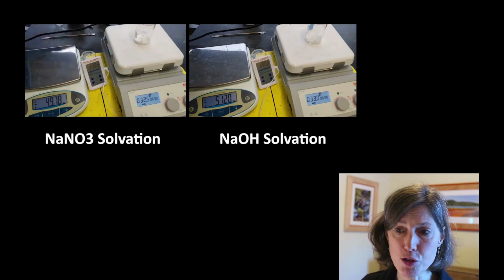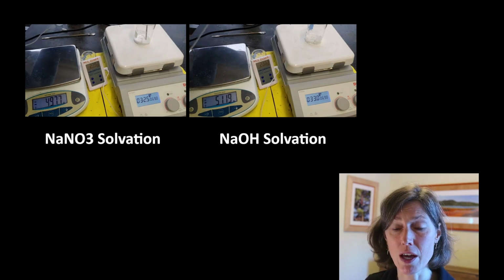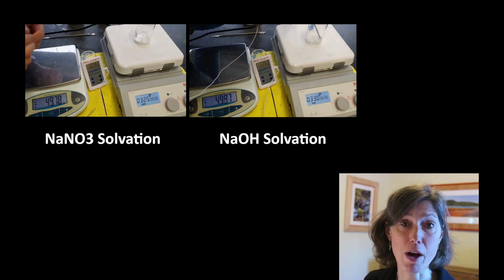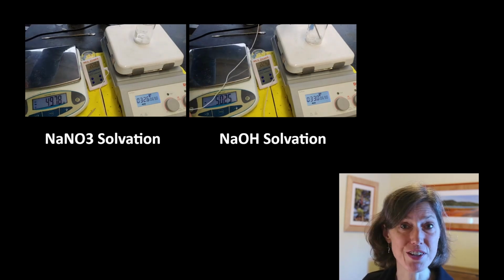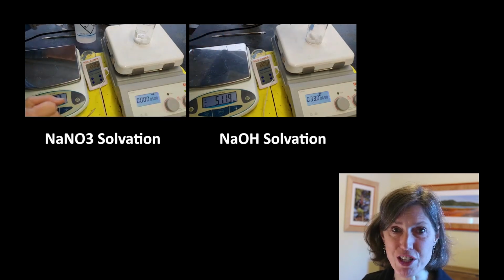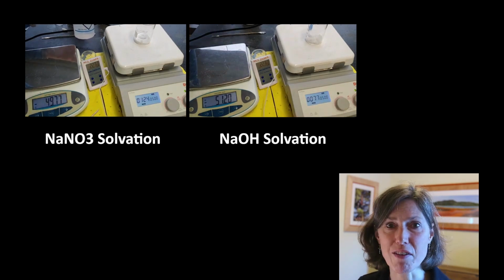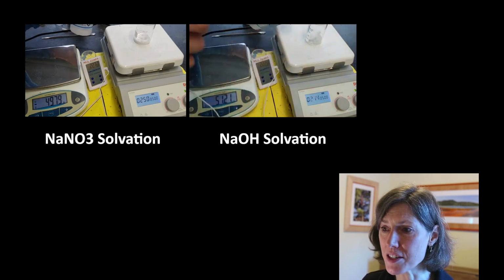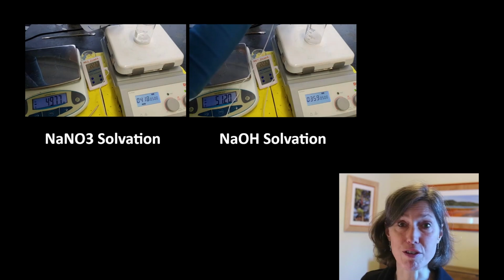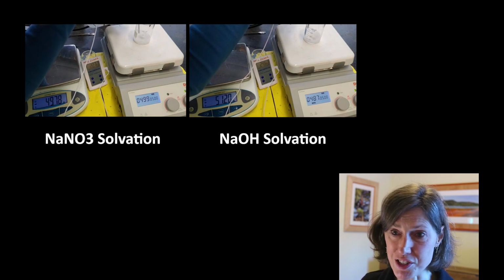So once you've added the stir bar, crank up the stirring, and then the thermometer would check how much the temperature is going to either rise or drop. So just picture 7 different lab groups doing 7 different salt solvation reactions, and they're all observing different things. So one side of the classroom is saying, oh my God, the temperature of my salt is starting to rise. Oh my gosh, for my salt solution, the temperature is starting to drop, and all the gradations in between.